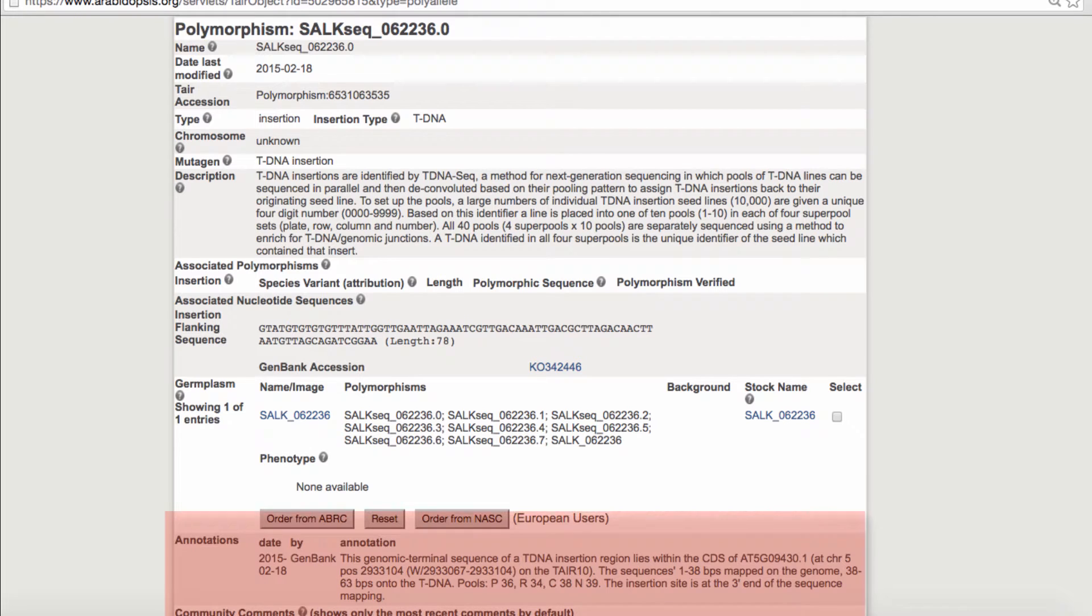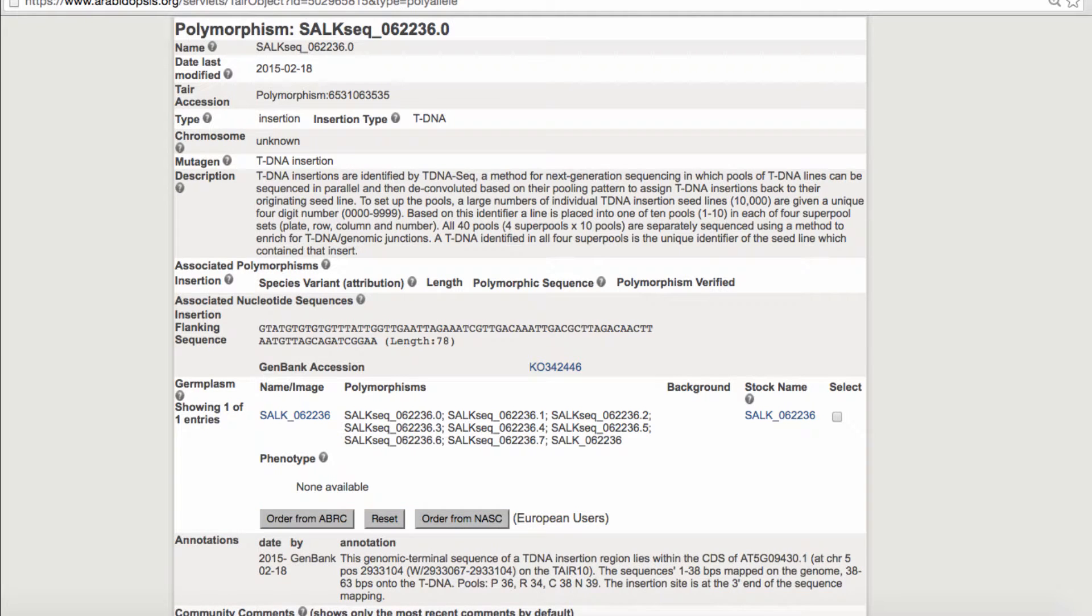The annotation section contains important information about the location of the insertion. In the case where the lines have not yet been linked to the TAIR locus, this is the only place you'll find this information.